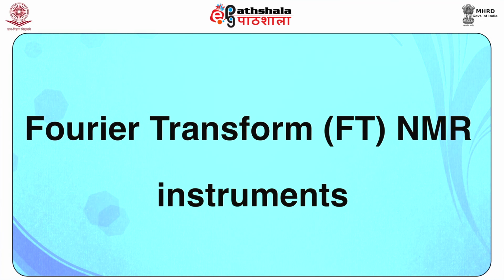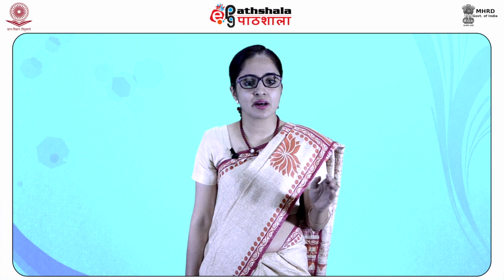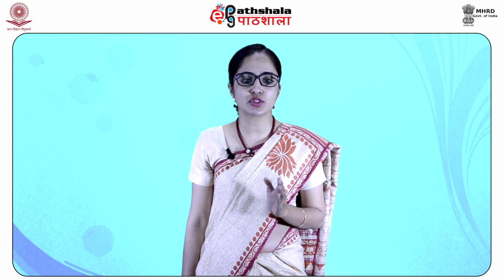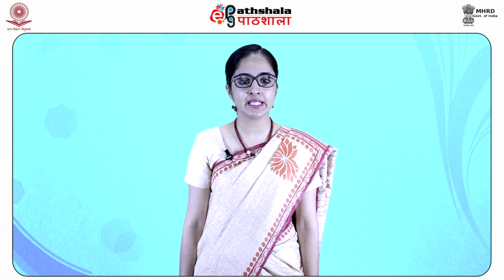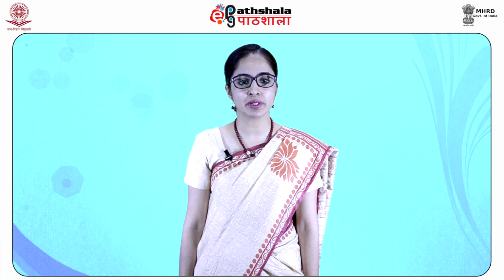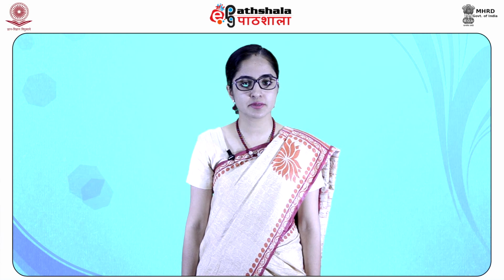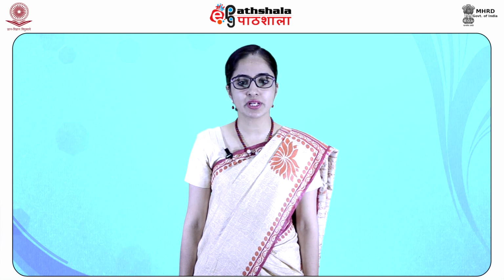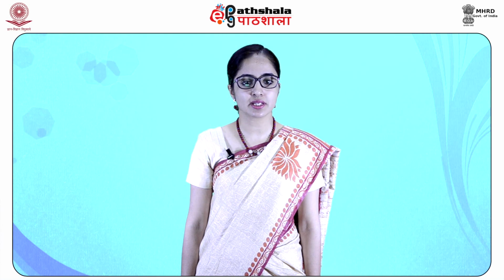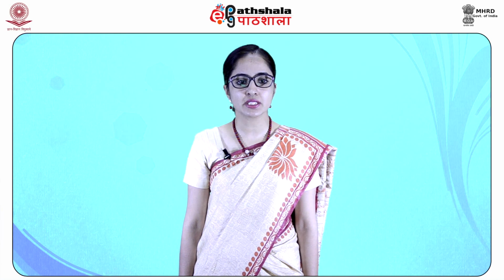Fourier transform instruments, or FT NMR instruments. These are the second type of instruments in NMR spectroscopy. To record a complete spectrum using a continuous wave NMR instrument requires a long time, a few minutes, because each transition is induced in succession by continuous scans from low field to high field.